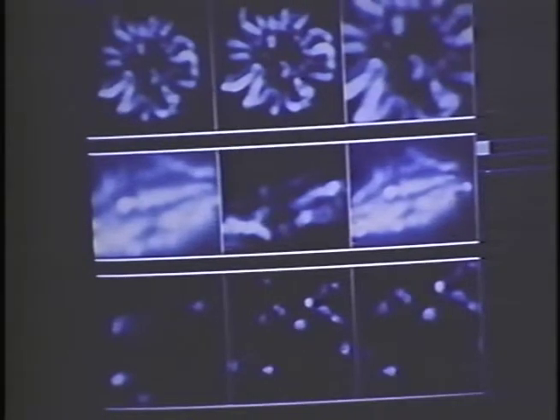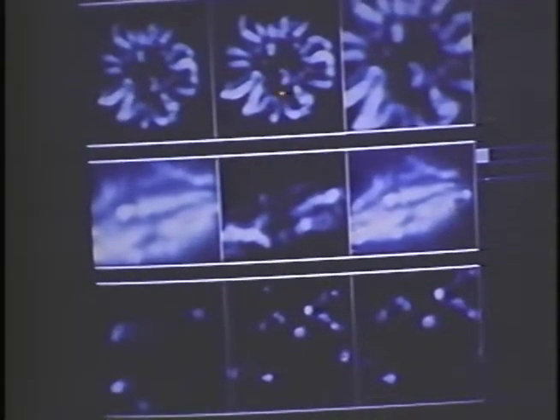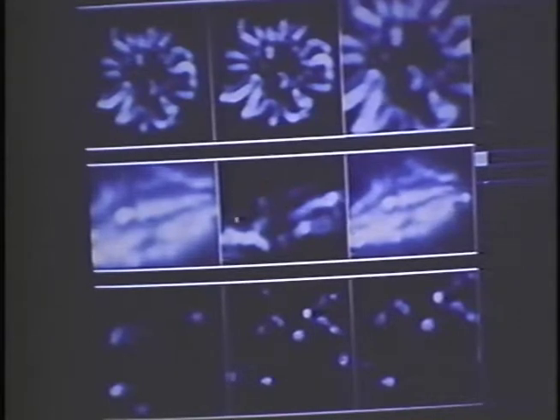Now, if what is in each of these windows is geometrically a different aspect of your object, for example, let's imagine this was a left view and that was a right view, we could also, at the same time, in another window, be showing a perpendicular view that comes in at a different angle. And then when you go in with your cursor, in 3 dimensions, as you move in this window, the cursor will move in this window and in this window simultaneously, showing you all aspects of 3-dimensional space from different viewpoints. So the problem of doing stereo pairs over a wide angular range is already handled just by having the different images present here.